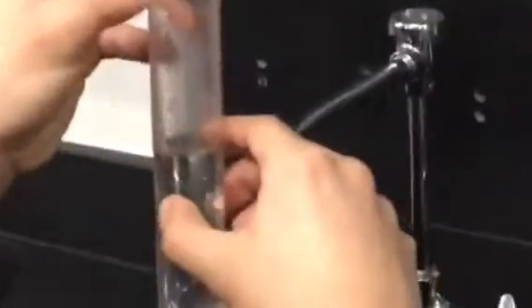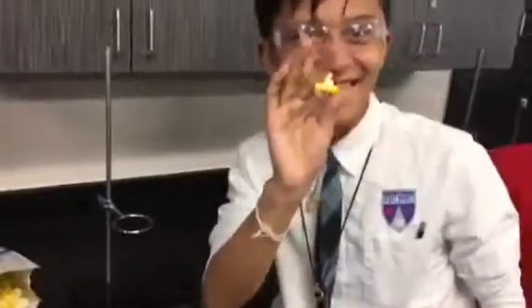We have to be precise. There we go. We got a good candidate. Okay, put it in there. Alright, we're emptying out the old water. 0.3. 0.3 still? Putting in the new one.